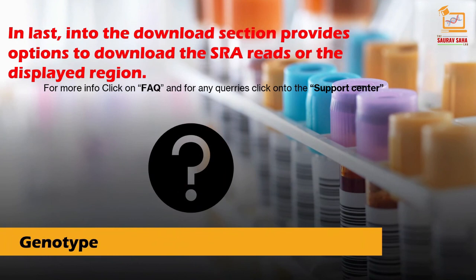Genotype. And last, the download section provides an option to download the SRA reads or the displayed region.